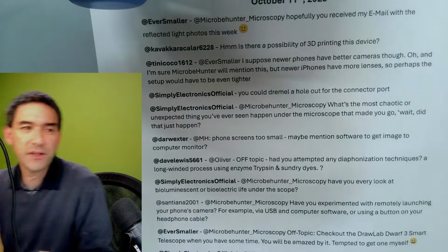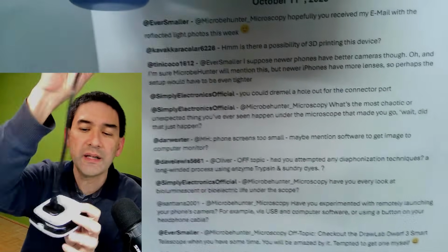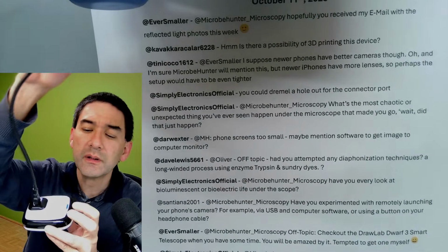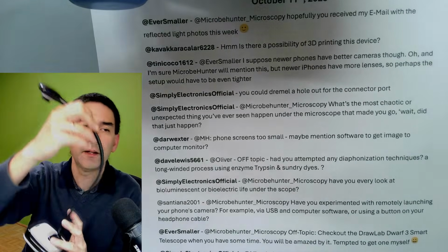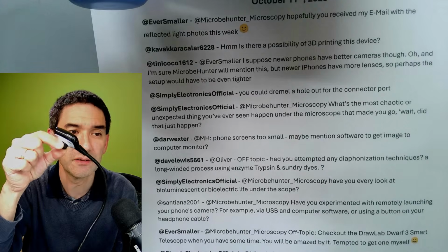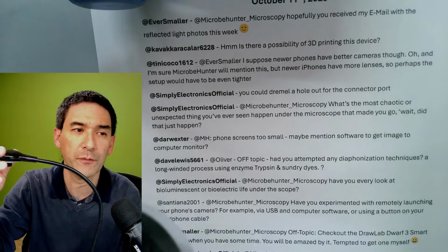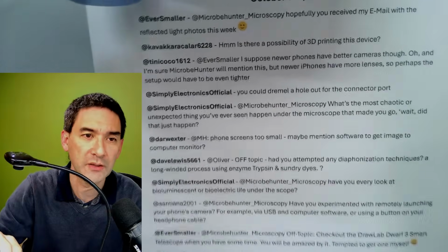I've got this here. This is also a camera, on the swan neck. Over here you can connect USB. No, not over here, we're here in the back. You can connect a USB, and what's possible as well, I've also tried. This has manual focus. That's nice. That's actually a camera for taking pictures of documents and so on. I used this camera before I had the current setup.